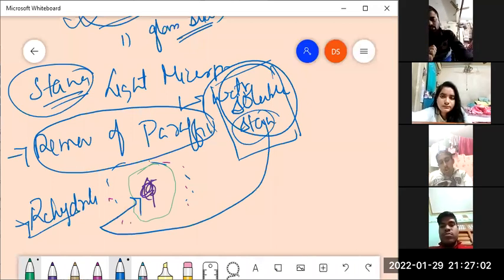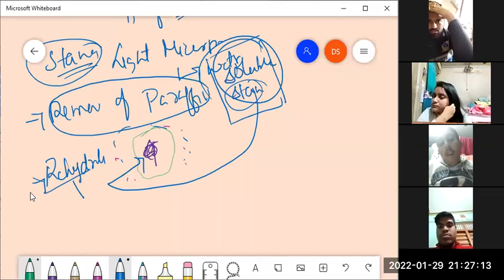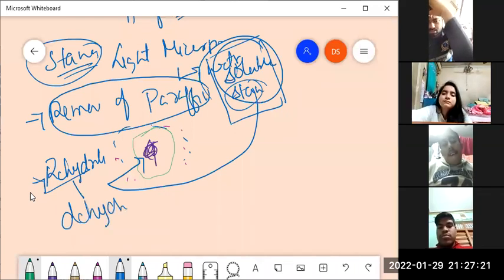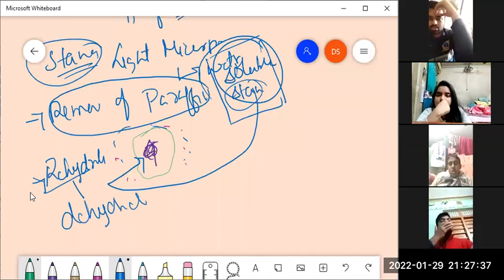Now, after staining, we have stained the tissue. After staining, this water that was introduced in the rehydration steps can again be removed. This has to be done as a necessity. If rehydration is a step, then dehydration would again be a step. Because if we are not dehydrating that tissue, we would not be able to retain that tissue for longer duration of time. See, we have already sectioned it.